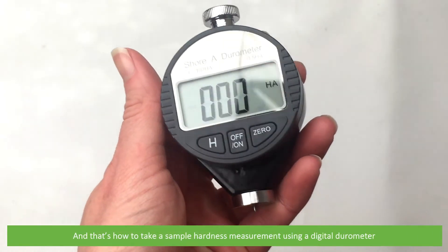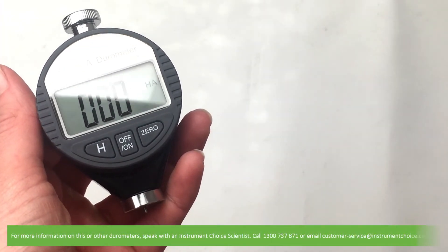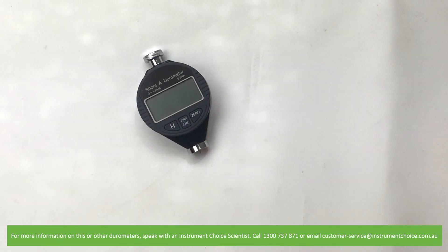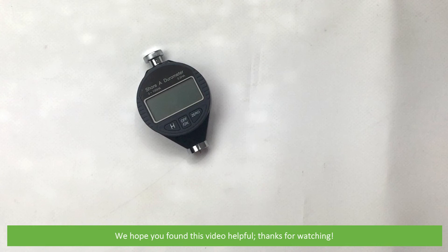And that's how to take a sample hardness measurement using a digital durometer. For more information on this or other durometers, speak with an Instrument Choice scientist. Call 1300 737 871 or email customer-service at instrumentchoice.com.au. We hope that you found this video helpful.